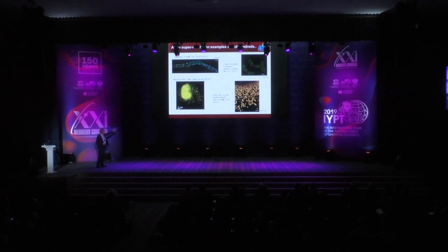On the lower left are the very small aggregates from Huntington's disease. The amyloid diseases all have very small fibrils and aggregates that form inside cells, and many of the sizes are below the diffraction limit. This is actually observed with STED microscopy because we have also built a STED microscope.